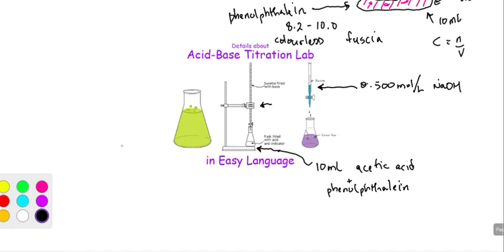The first trial that you do, you don't know how much volume of NaOH is required, so you might overshoot that a little bit. So in most lab analyses, you do about four trials because the first one you're a little bit off. After the first one, you get an idea of how much volume it's going to take for this reaction to stop, and you can start to go much slower as you approach that volume. So you'll get much more precise results. So that's how you're going to be setting up your glassware.